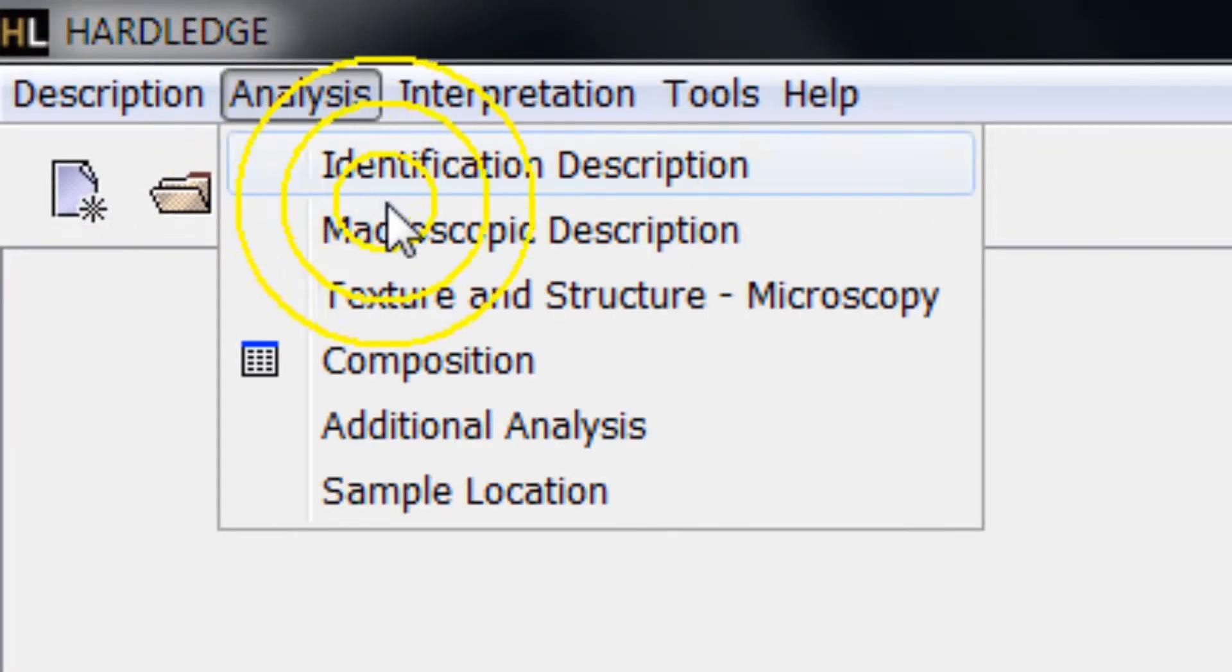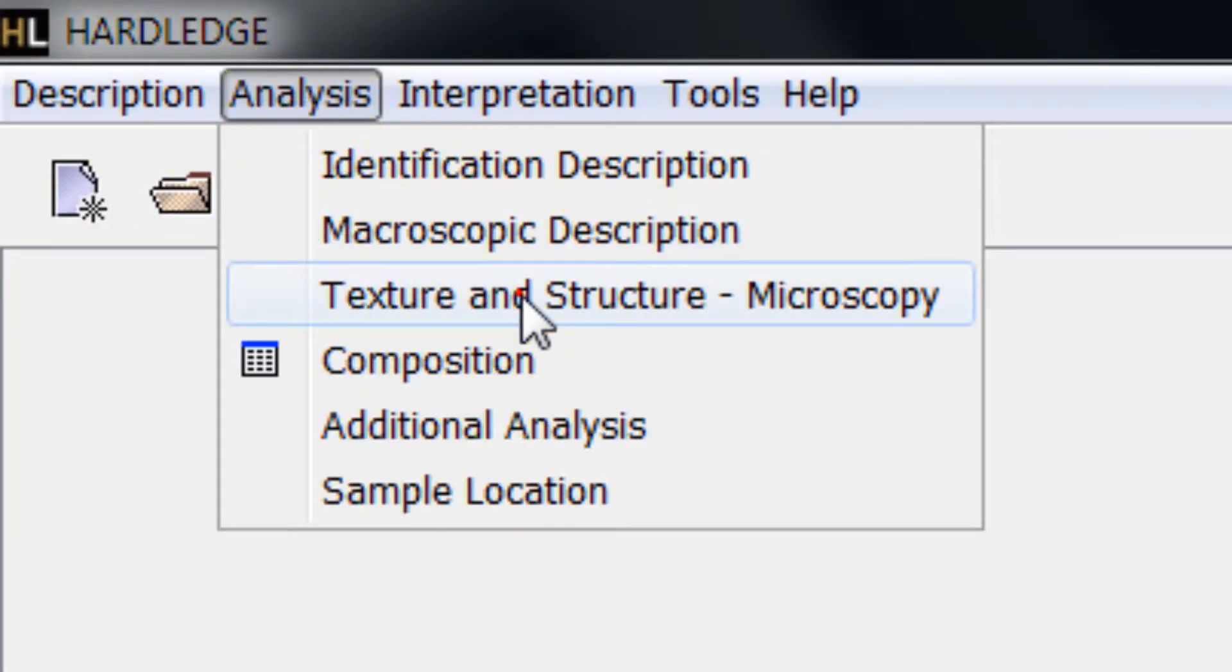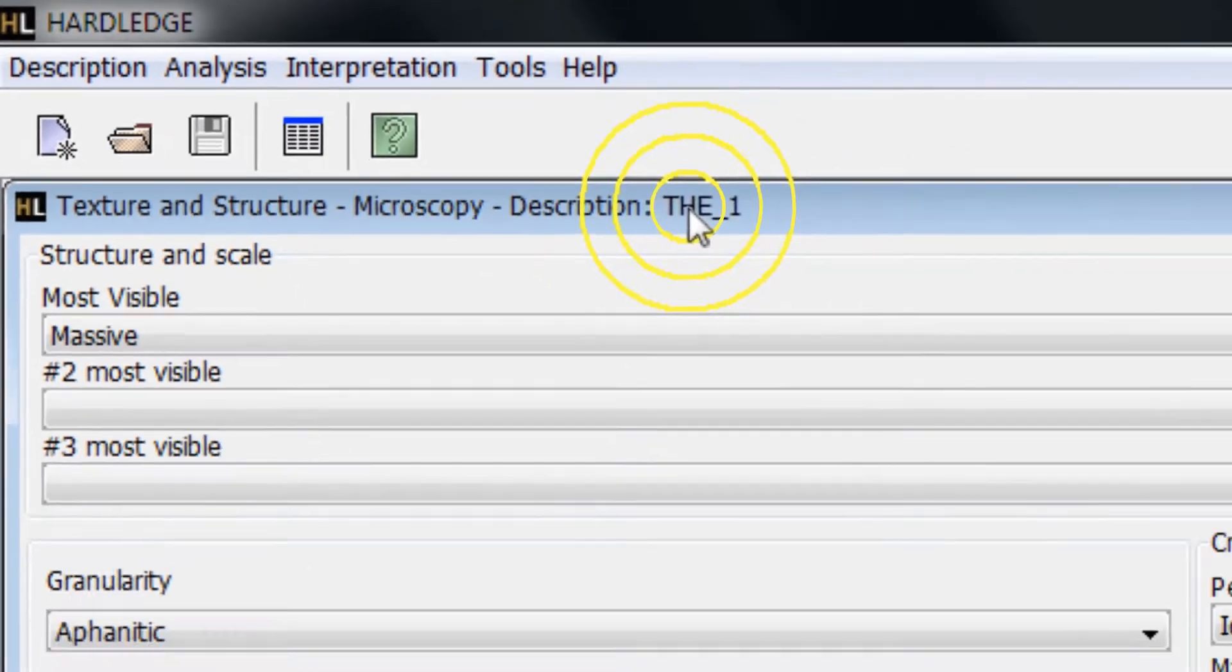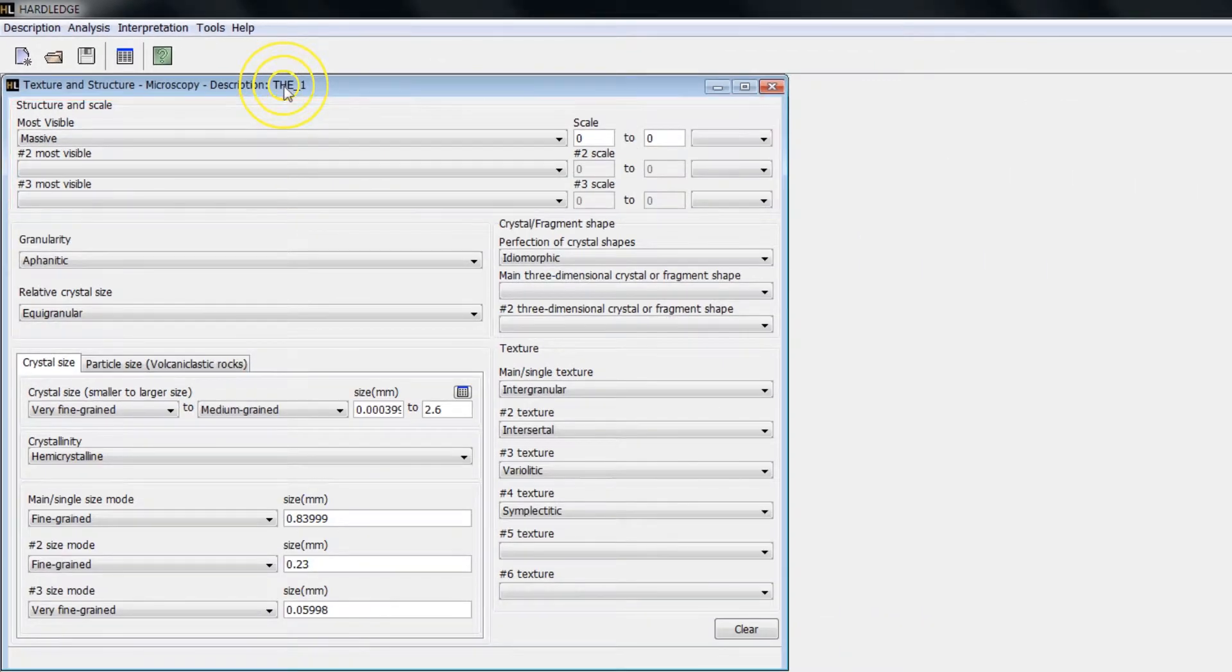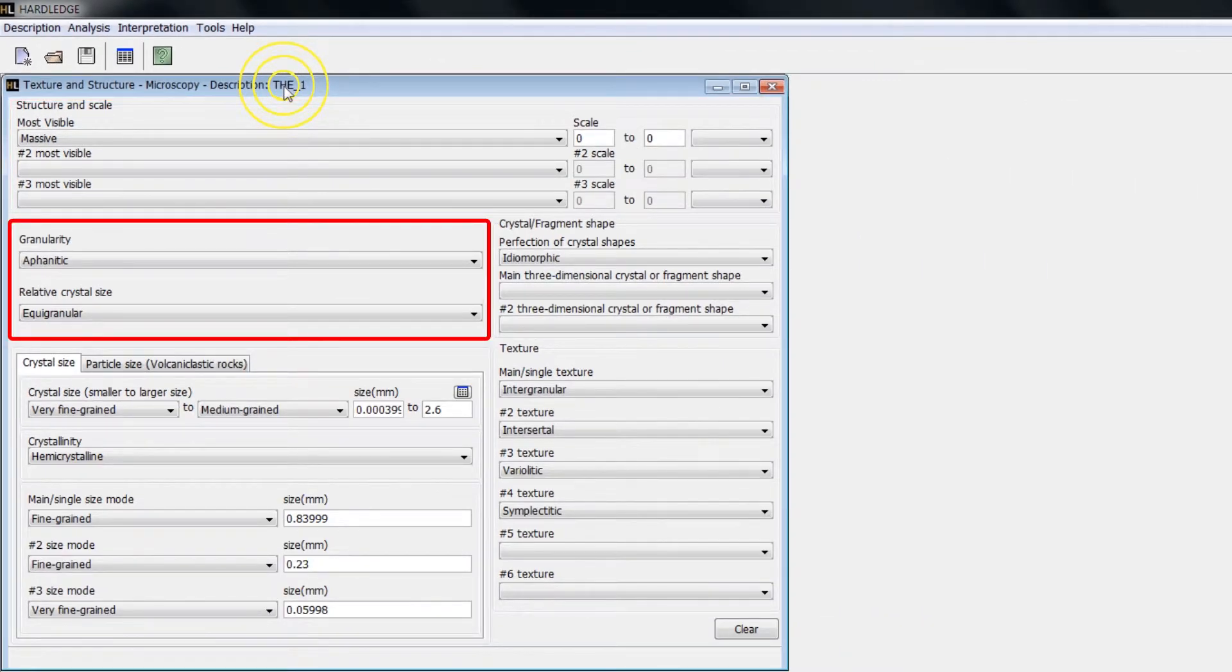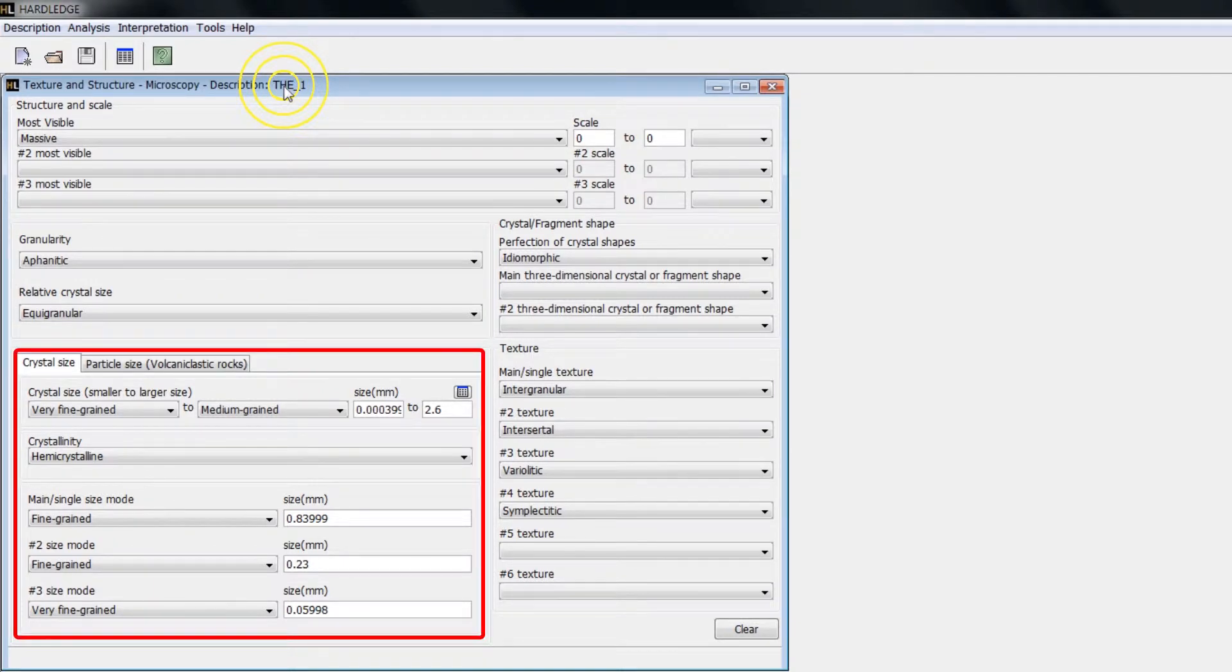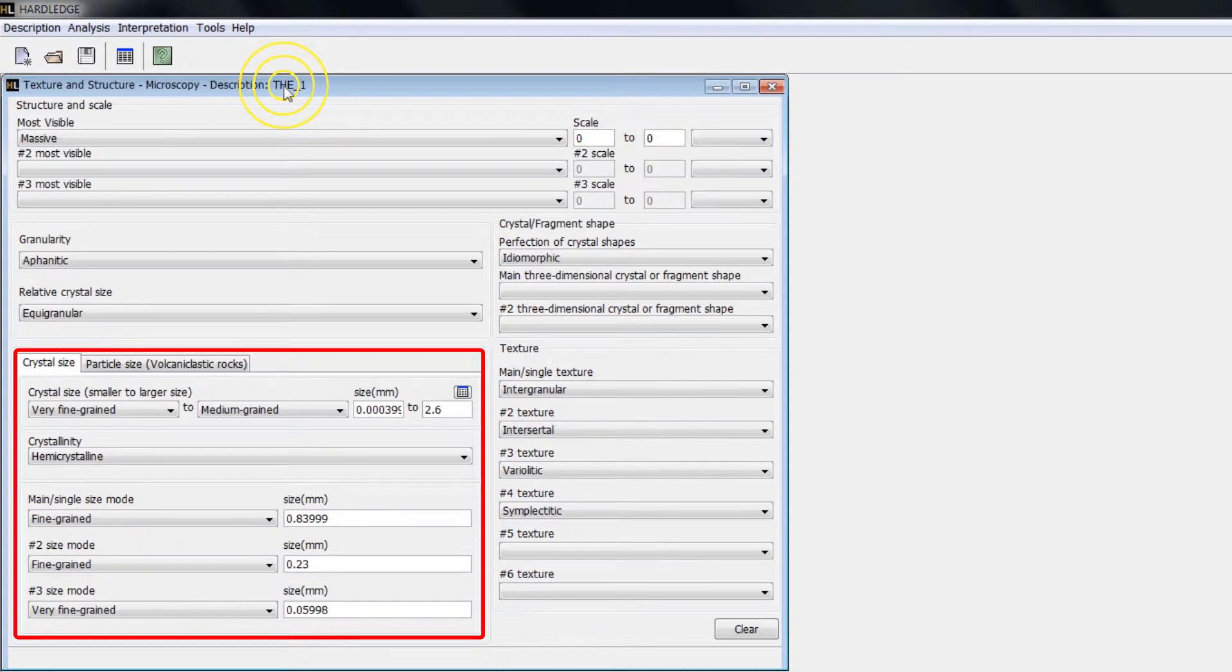In Texture and Structure microscopy, you can inform the main structures and their size, the crystal's granularity and relative size, including the crystallinity, the range of crystal sizes, the main single modal size, and other modal sizes.